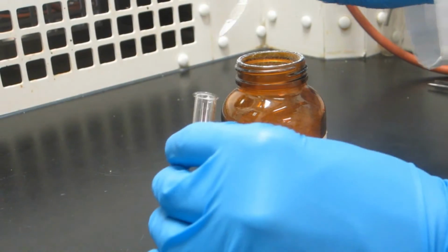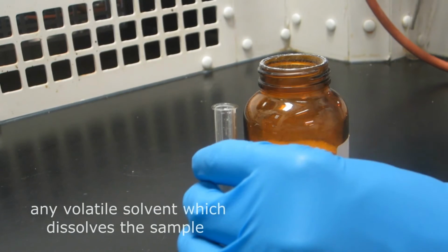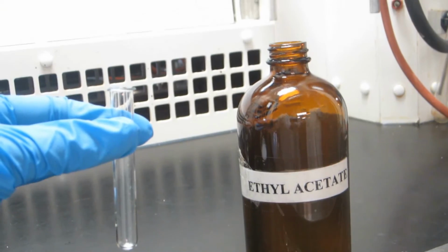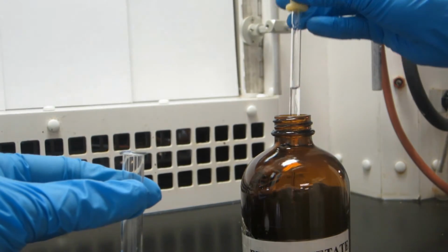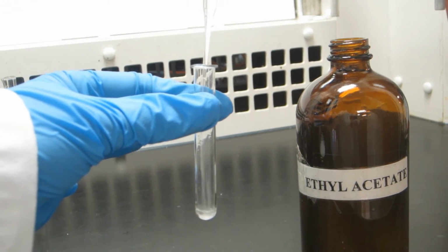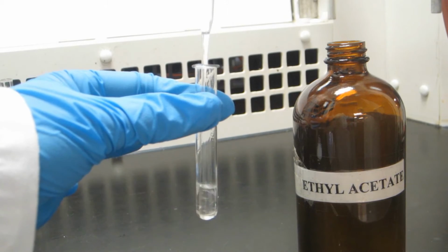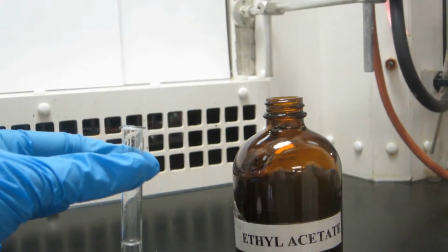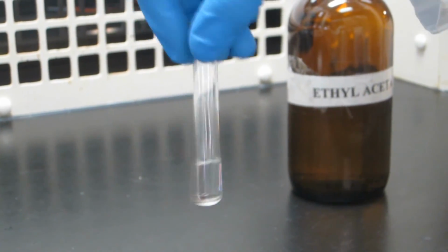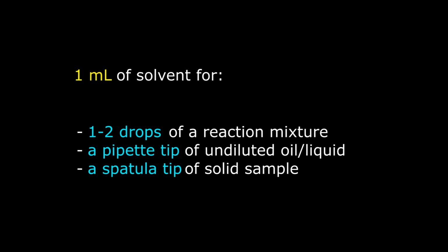Dissolve the sample in a small volume of any volatile solvent which dissolves the sample. Diethyl ether or ethyl acetate can be used for most organic compounds. Typically, for a reaction mixture, 1 to 2 drops of the mixture should be diluted with approximately 1 milliliter of solvent. For undiluted oil or liquid samples, a pipette tip of sample should be diluted with approximately 1 milliliter of solvent. Lastly, for solid samples, a small spatula tip of sample should be diluted with approximately 1 milliliter of solvent.